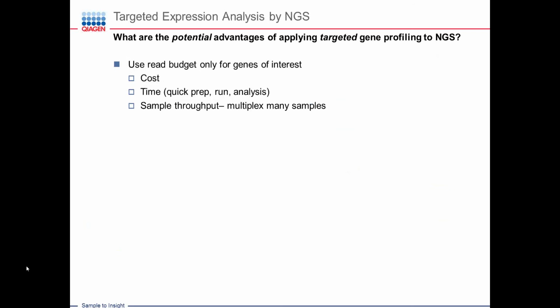And so that takes us to targeted expression analysis. There are potential advantages of applying targeted gene expression profiling. You can see the word potential is in italics because these are all theoretical, and they're real if you execute properly.